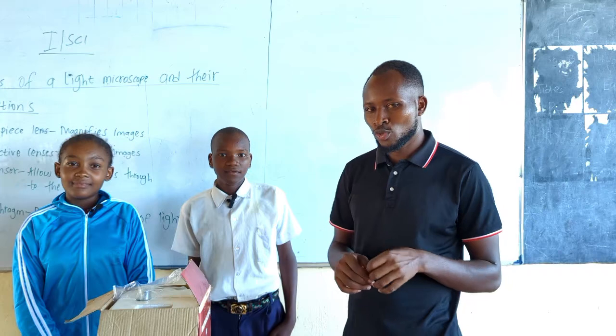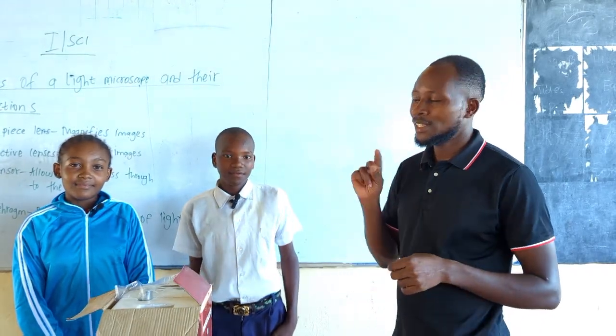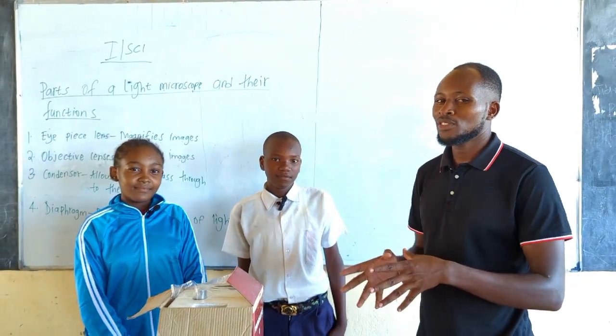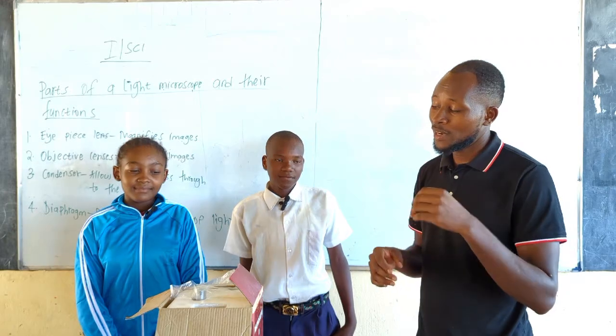Today we have two students here, Amanda and Ibra. They are going to show us the parts of a microscope and its functions.